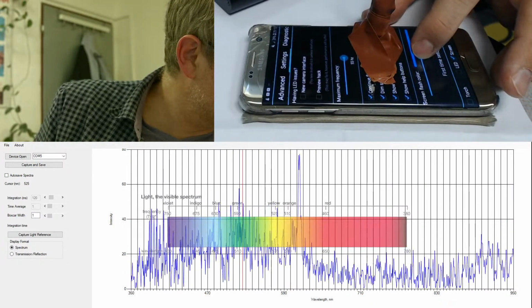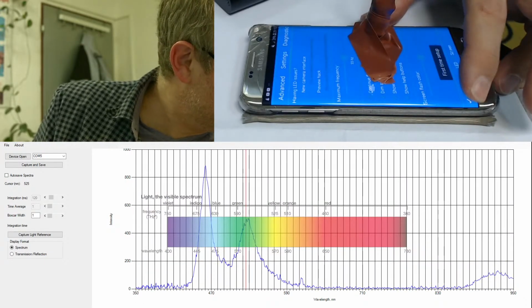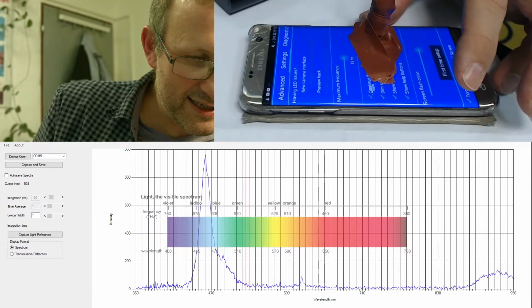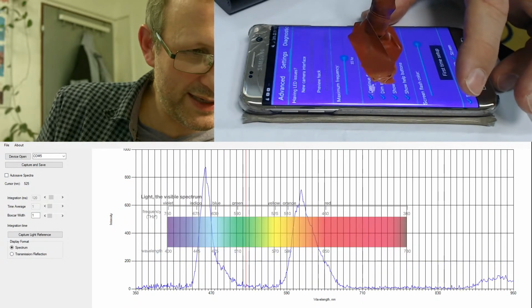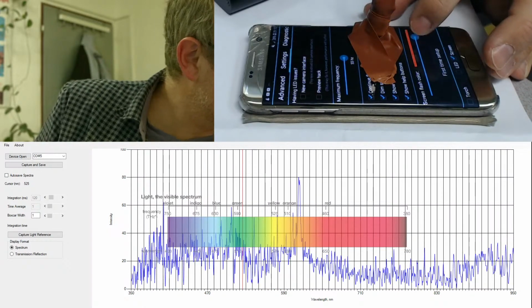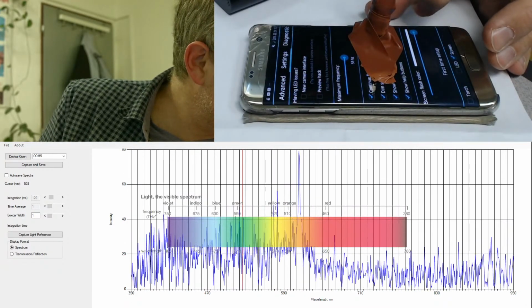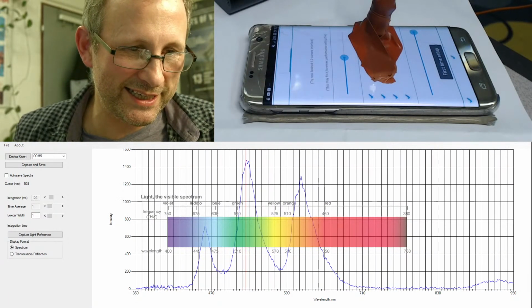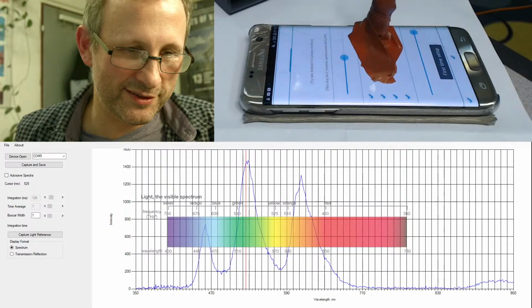This is more blue. And then we're going to go for a dark blue, really dark blue. Down there, and then a sort of pinky mauvey colour, and then kind of orangey reddy colour, and then we'll go all the way to the white. There's the white. So you can see the RGB producing the white on this display.